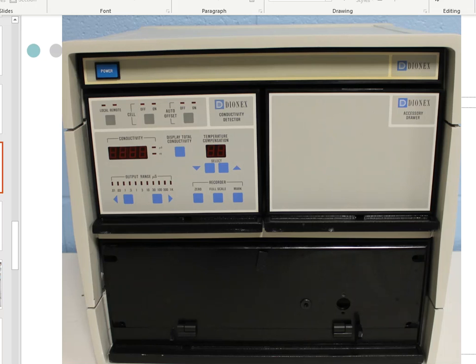So here's a picture of an old Dionex ion chromatography system, and what you're seeing is that it has a conductivity detector on it. This system is basically what they would use back in the day to separate these ions and give us some peaks, particularly in the anion exchange world. Cations were great, but cations were really taken care of by atomic spectroscopy during that time, and here we have something that meets the needs of a laboratory in a different area, and those are negative ions, or anions. If you take a look, you'll see this logo with Dionex.